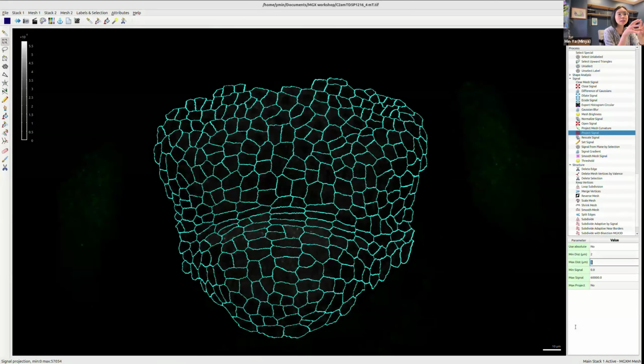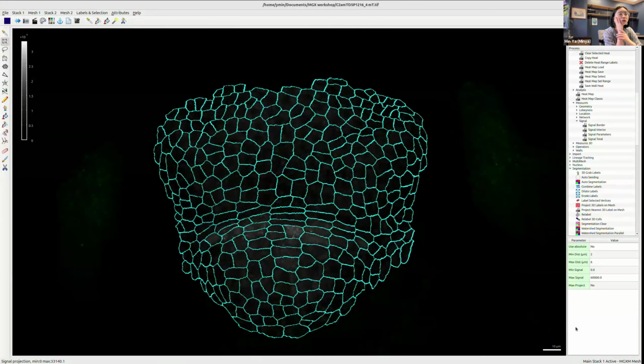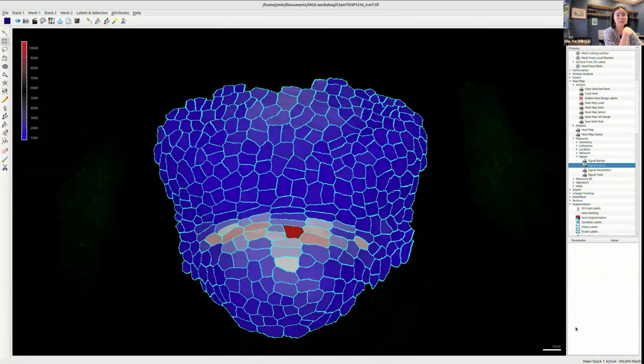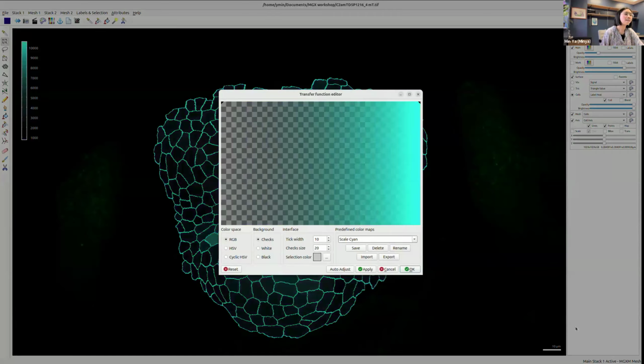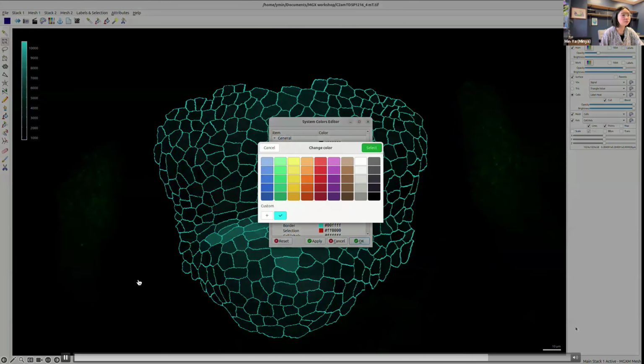For this second projection, the numbers can be adjusted according to your own samples. After that, we measure the signal intensity by going to heat map, and there's a function called signal interior, and voila, that's our heat map for the signals. And then we can do some aesthetic things again, or change the borders.